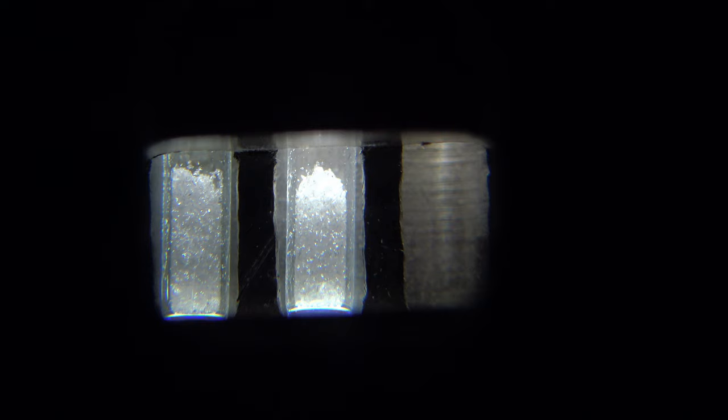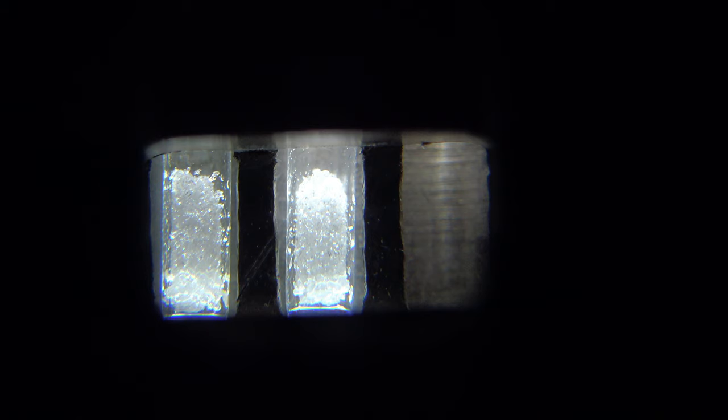151 degrees. 152. 153. 154. 155. 156. 157 degrees. I start to see movement. 158 degrees. 159 degrees. Some more movement. 160 degrees.